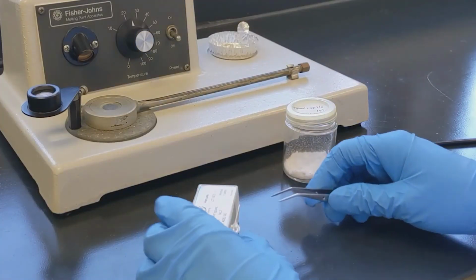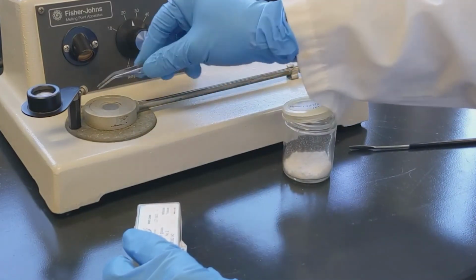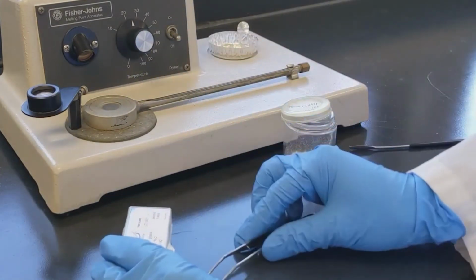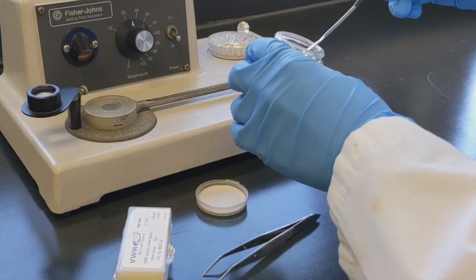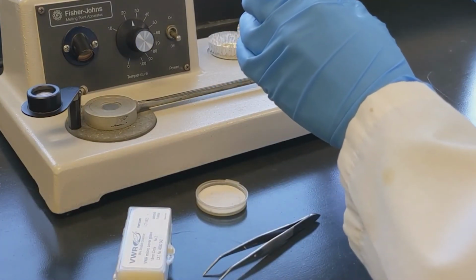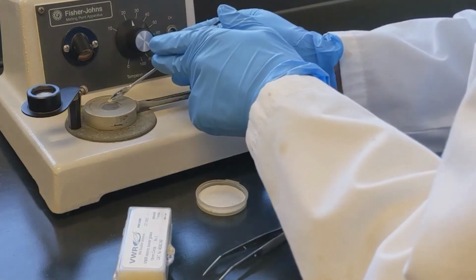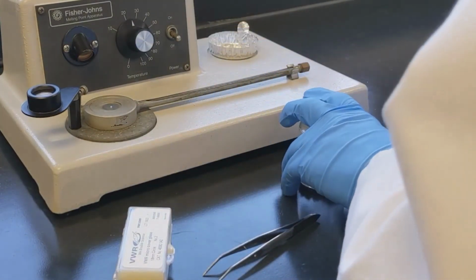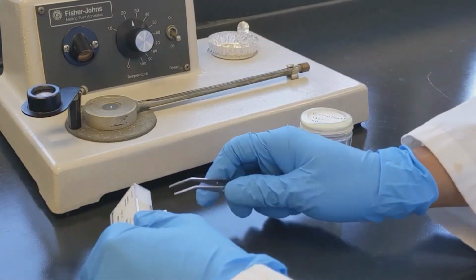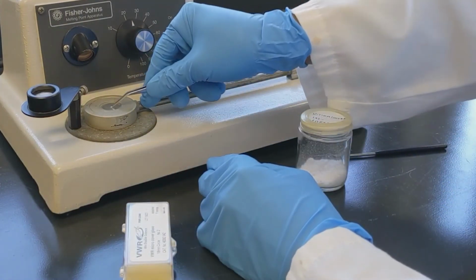With a pair of tweezers, pick up a clean cover slip and place it over the aluminum heater. This is the first cover slip that keeps the metal clean. Next, use a micro spatula. Place a small amount of sample on the cover slip. Then, using tweezers again, pick up another clean cover slip to place over the sample. The sample is now sandwiched between two cover slips.